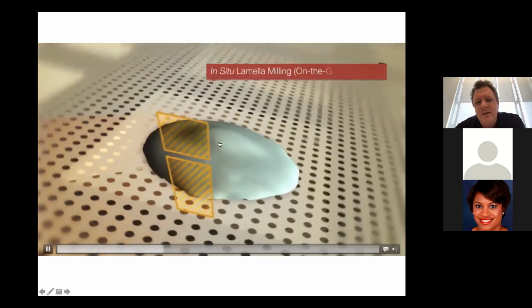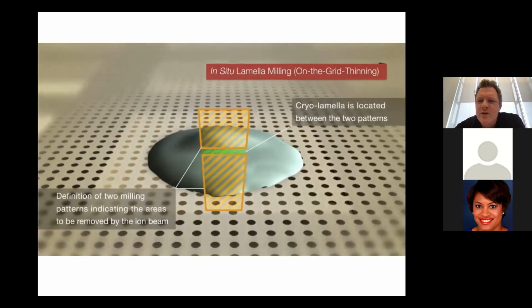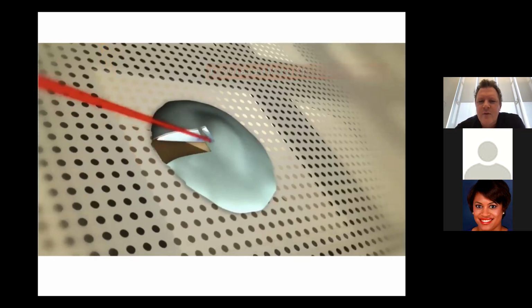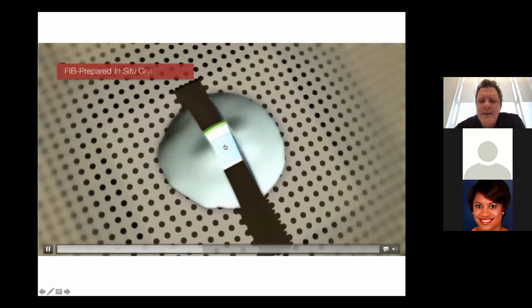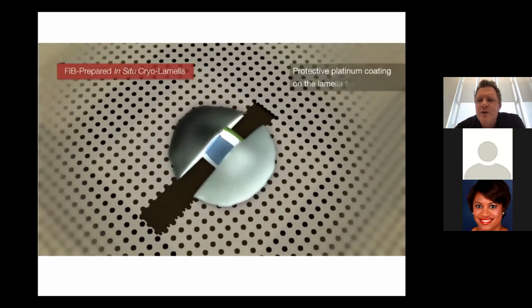We believe it's still happy, and these additional steps are really to protect from radiation damage. We're trying to ensure that this frozen cell is as protected as possible. We then shave this down, and we're left with a sort of thin section of the cell, which we then take across into the Krios microscope to image at different tilt angles.